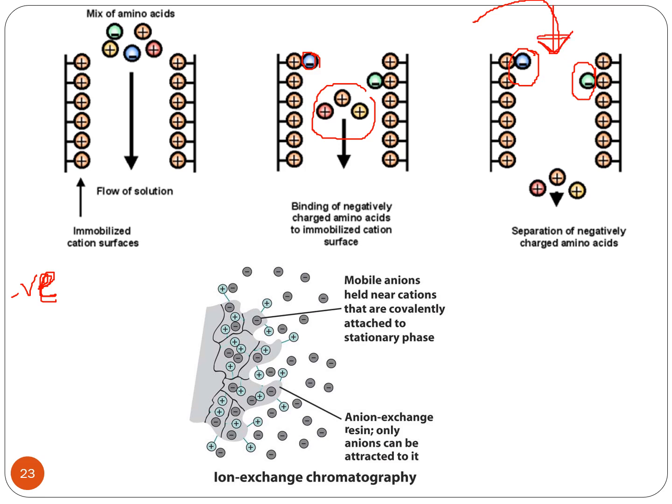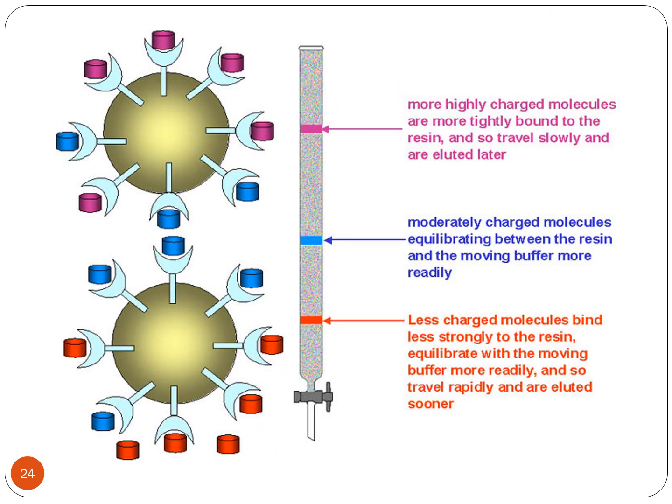So mobile phase ni kita boleh guna different concentration or different pH untuk elutekan kita punya anion ni. So kita boleh tahu yang mana will elute faster, yang mana yang akan elute a little bit later. Okay, so untuk lebih faham, you boleh tengok the video.